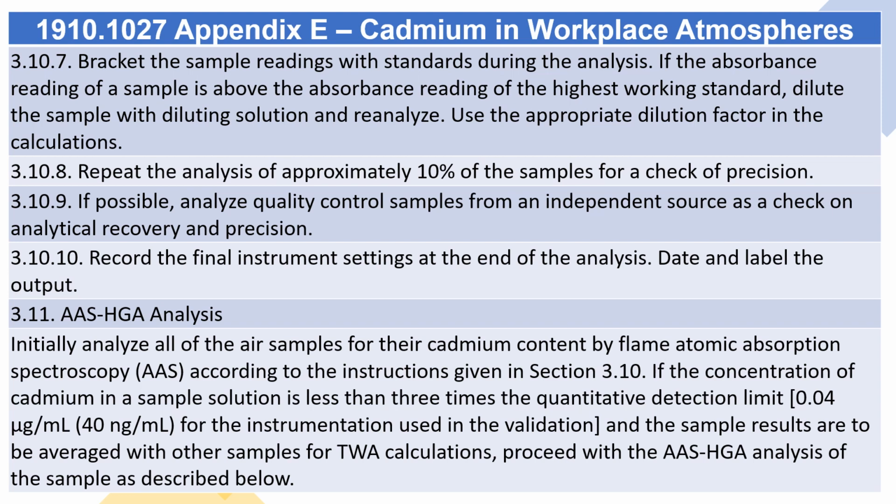3.10.10. Record the final instrument settings at the end of the analysis. Date and label the output.